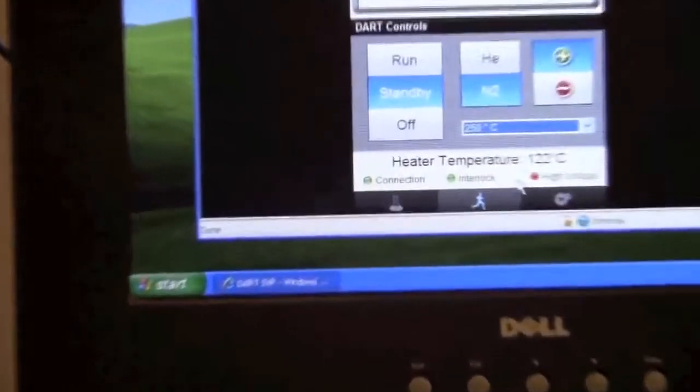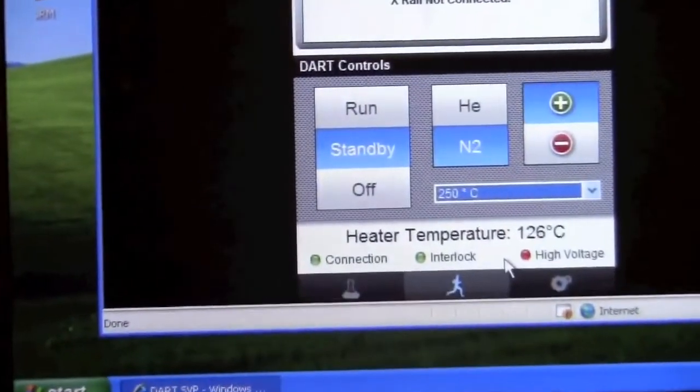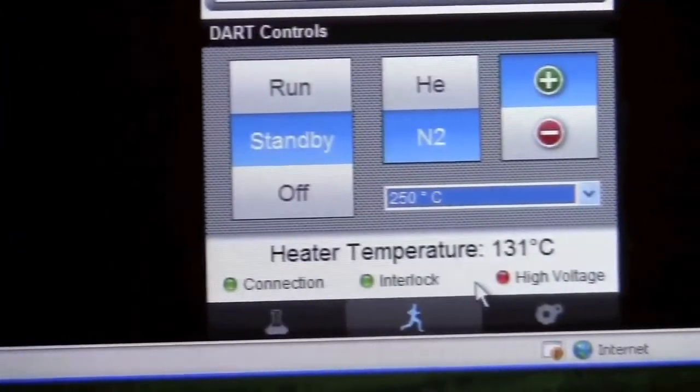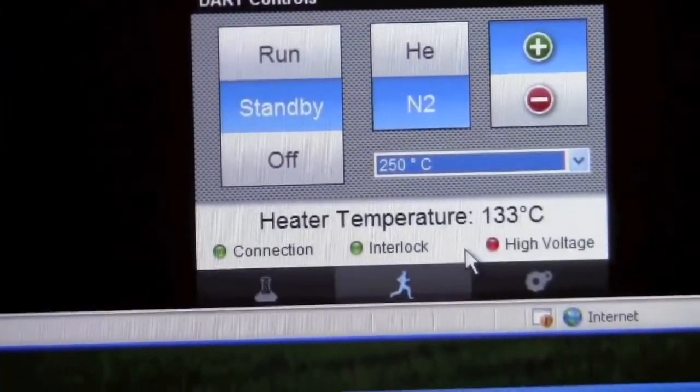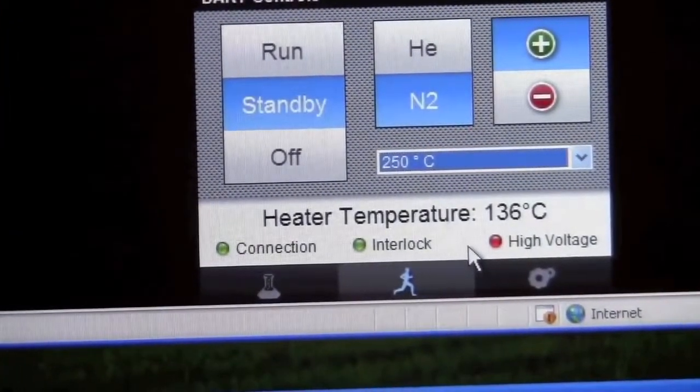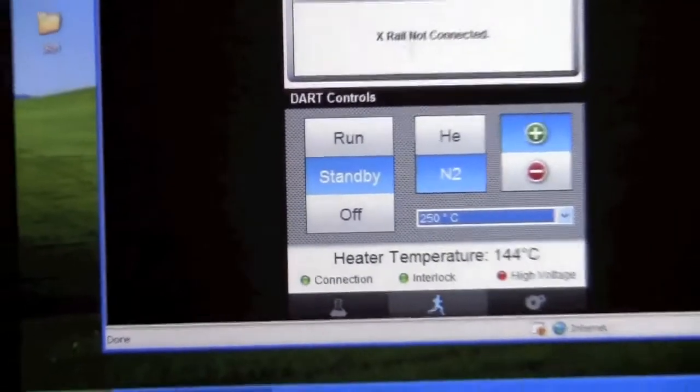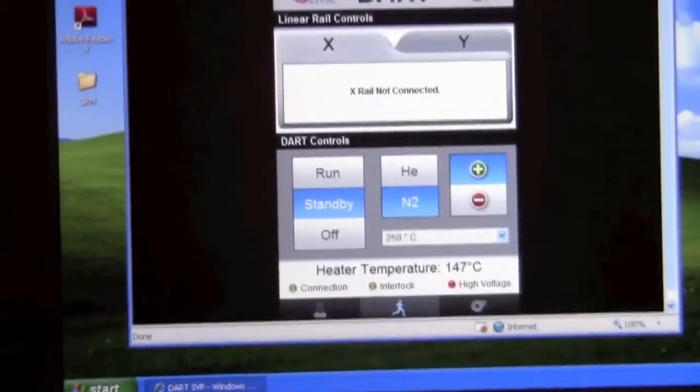As the temperature is ramping up, we can start up the mass spectrometer software. To start that, we click on Mass Links.